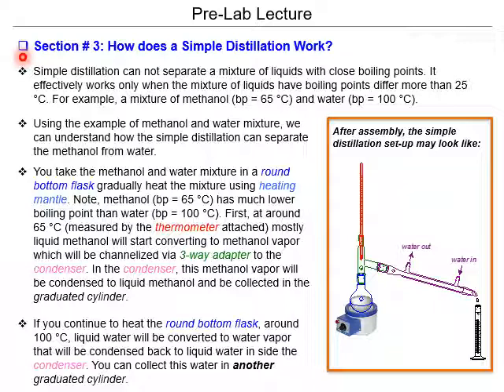For example, a mixture of methanol and water. Mixtures whose components have very similar boiling points are often called azeotropes. An example of an azeotrope could be, for example, ethanol and water. Ethanol has a slightly higher boiling point than methanol, but it's sufficient. The increase is enough so that sometimes it's difficult to separate water and ethanol with simple distillation.